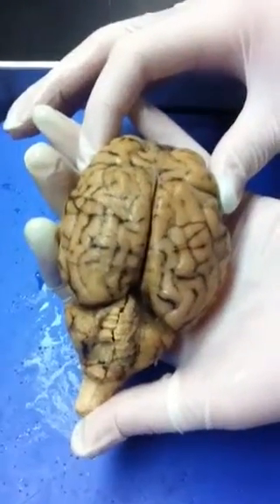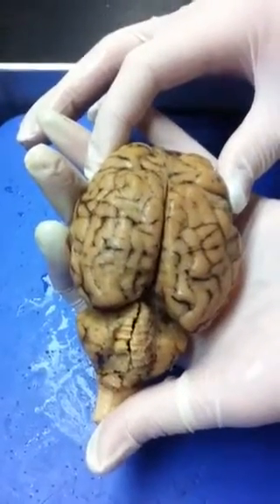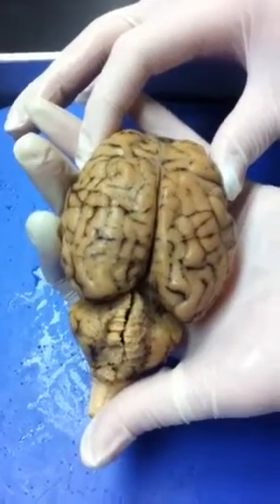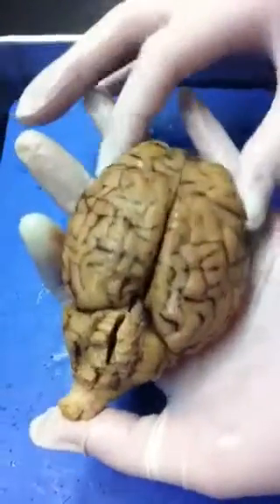We are going to dissect and show you the major anatomy of a sheep's brain for Mr. Lankford's 2401 Anatomy and Physiology 1 class. This is Donna Shveyda, Belinda Rothfeld, and Raegan Cassels. Okay, I'm going to start out by showing you the inferior side of the brain.